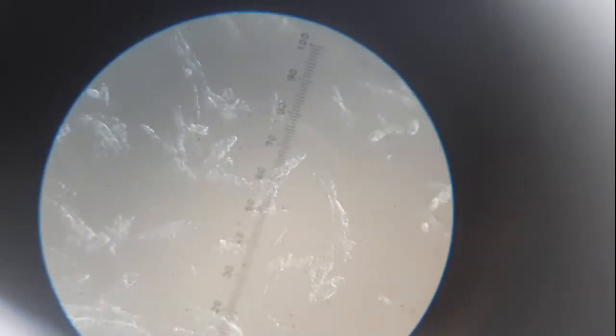As you can see here, the crystals are very well formed, and we have determined the average particle size, which was found to be 27 units on the eyepiece. Now we will proceed to the 30-minute sample.